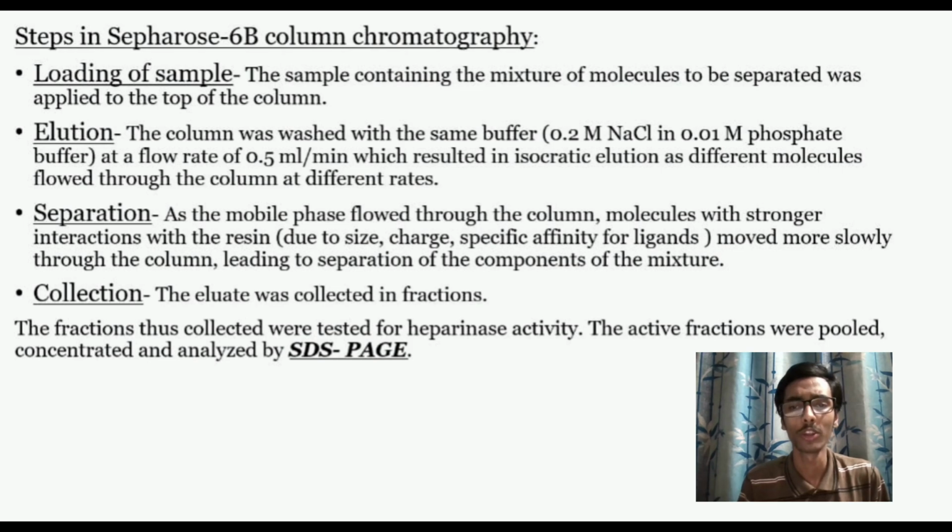Second, loading of the sample. Now the mobile phase along with the sample containing the mixture is run through the column. In this process, the molecules which have size smaller than the beads interact with the resins, whereas the larger molecules are eluted outside. Third, washing.